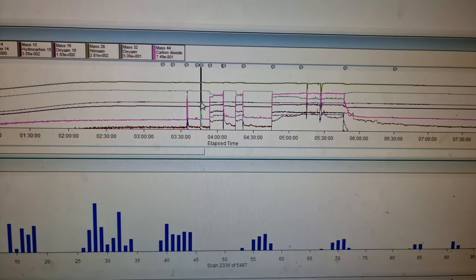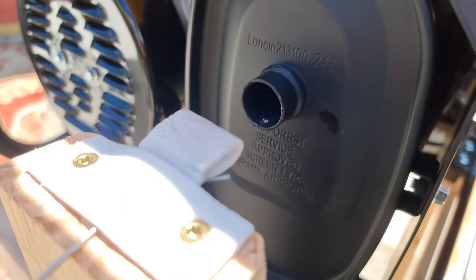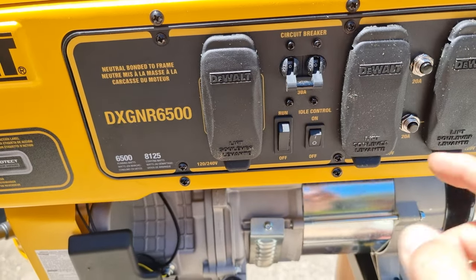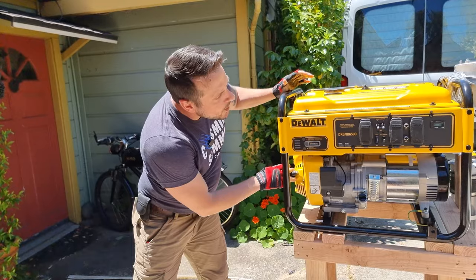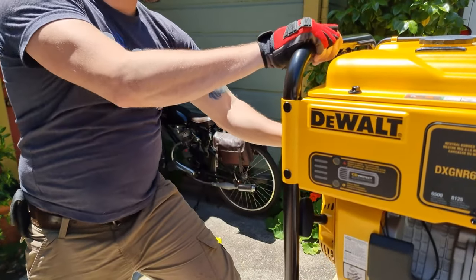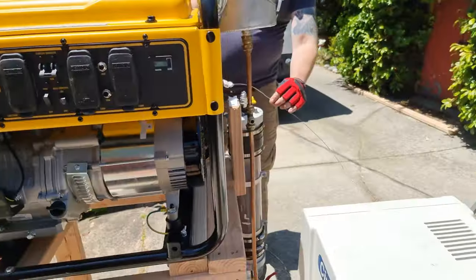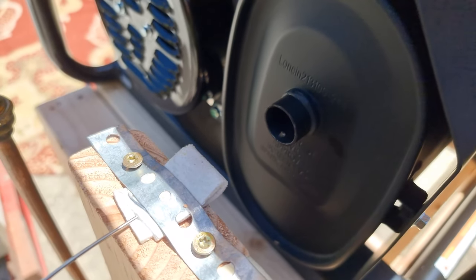As we go through, we tried a number of different ways to attach the filter. So we now have it looking at the exhaust going into port 4. Attempt three to run this — we've got a strap across the top of the sampling port and hopefully it will stay in position this time.